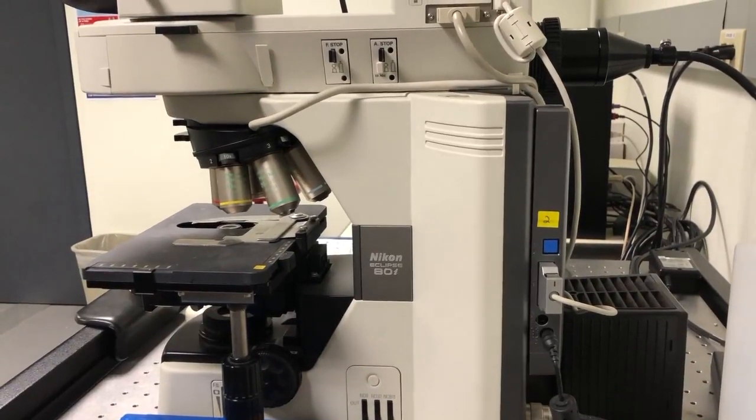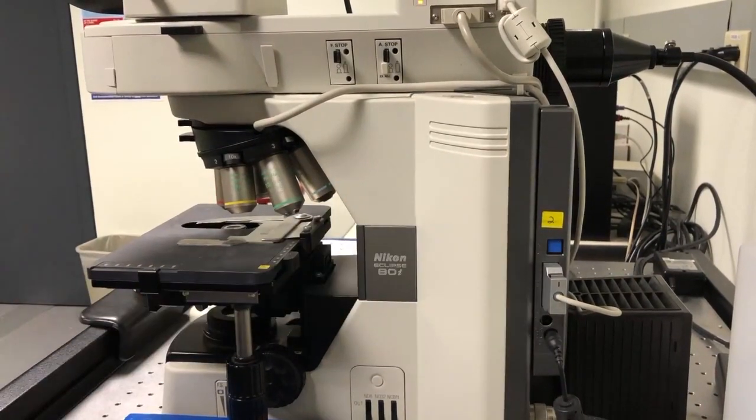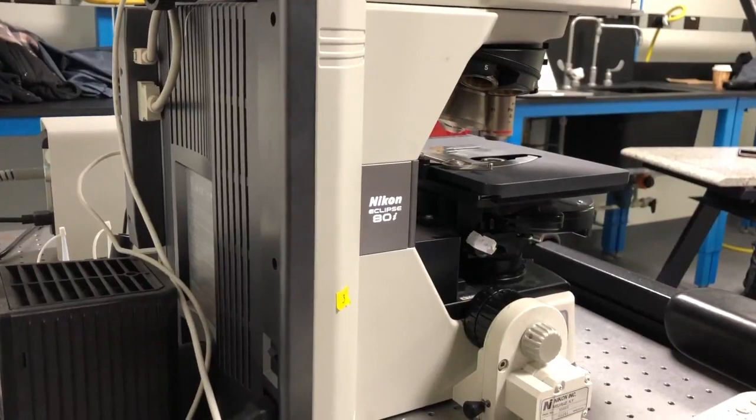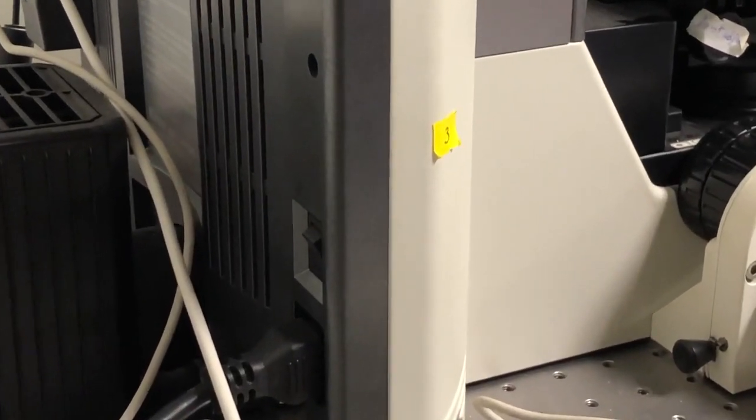Next, press the blue recessed square button labeled 2 on the right back side of the microscope to turn the microscope itself on. Then turn on the C box labeled 3 by switching the toggle at the left rear side of the microscope.